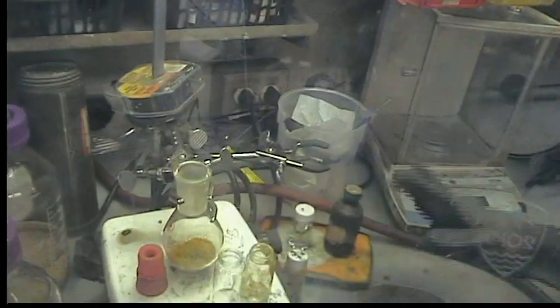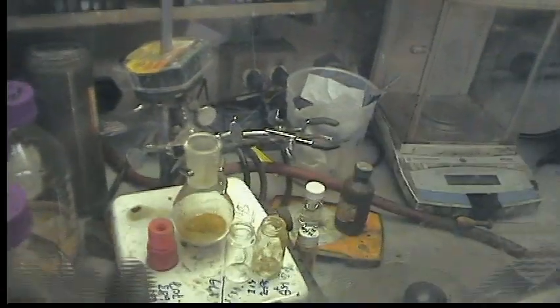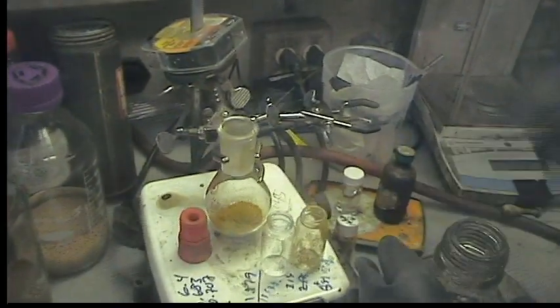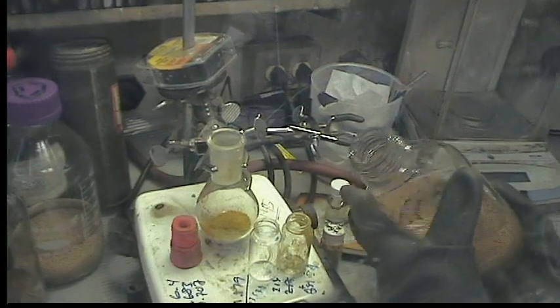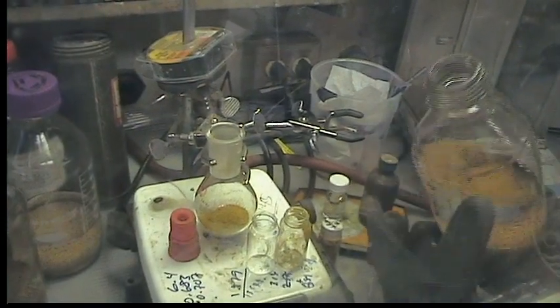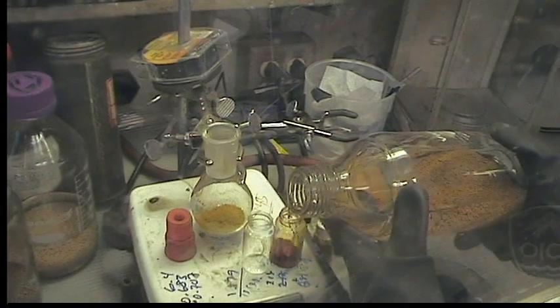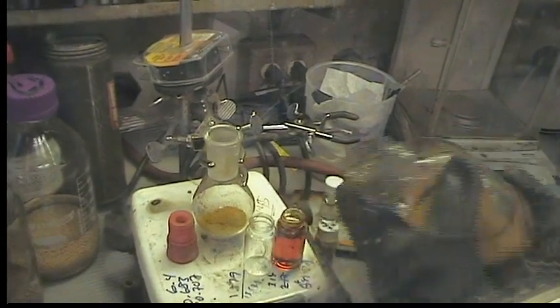You want to get this into your flask along with 60 milliliters of THF before you open your arsenic trichloride, because you don't want to contaminate your THF with arsenic trichloride vapors. I usually just measure out three vials of THF, which will be about 60 milliliters.